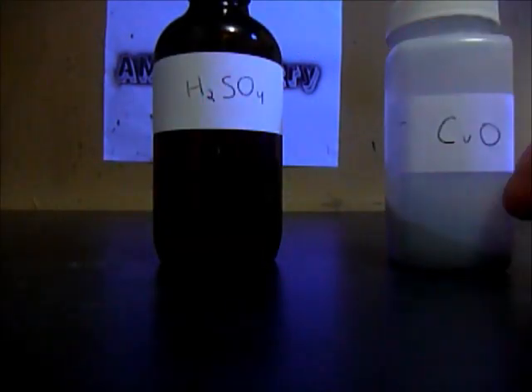Hey guys. Today I will show you how to make copper sulfate pentahydrate. So the chemicals you will be needing are sulfuric acid and copper oxide.